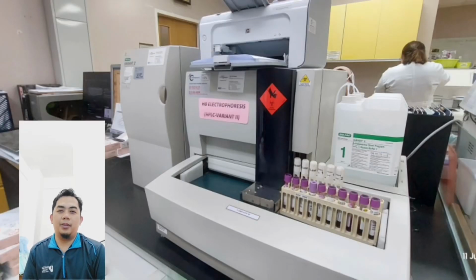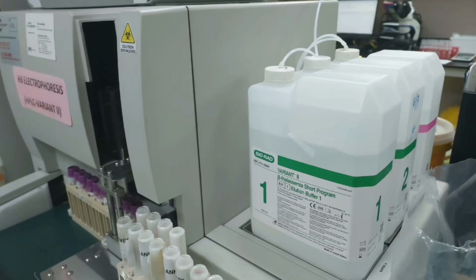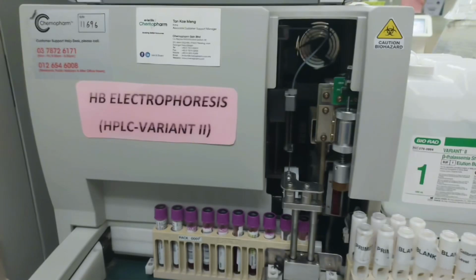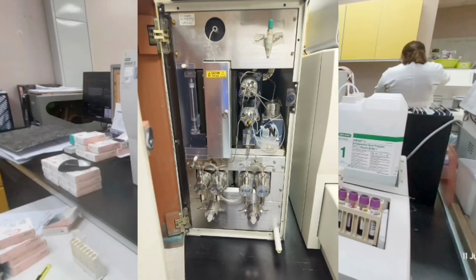Instrument and operation. This is the example that we use in the medical laboratory. Now, let's take a look at the setup of the HPLC system. First, we have the solvent reservoir that holds the mobile phase. This solvent is pumped under high pressure by the pump into the injector where the sample is introduced. From there, it flows into the column, the heart of the system where the separation takes place.